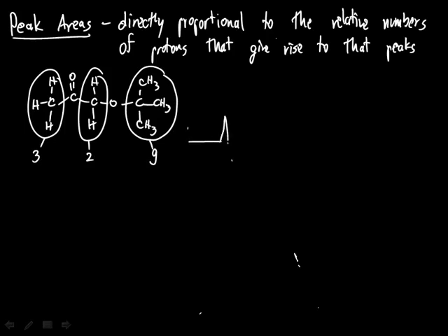The first one, probably the most showy one, will be those directly attached to oxygen. Then they will have those attached to carbonyl, the methyl group. And finally, we'll have the T-butyl group at the end. This is not drawn out to scale and might not correspond very clearly to an experimental spectrum, but what we will clearly see is that these 3 peaks have different areas underneath them.